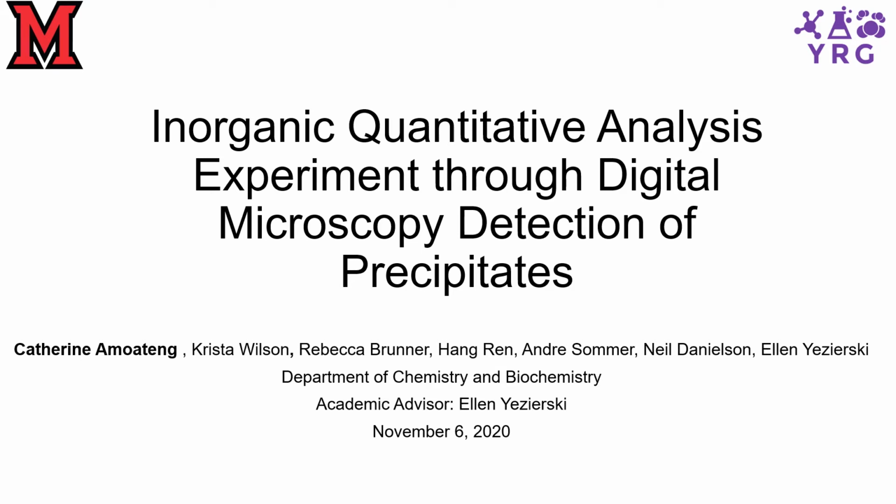For the next few minutes, I'll be talking to you about a design undergraduate experiment that uses the color of precipitates to quantify known trace compounds in solution.